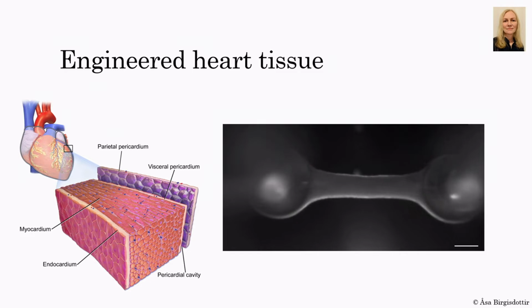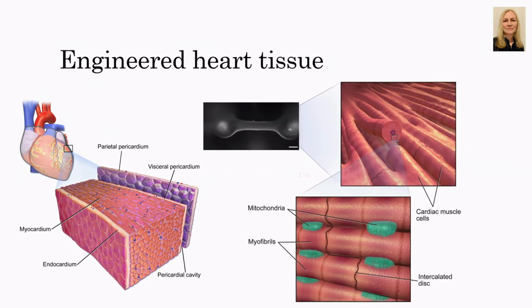And unfortunately, she is also very interested in mitochondria, which are on a completely different scale. So imaging these is a challenge. And I'm in optics, so we work together and try to find a solution for that, getting some 3D fast imaging of mitochondria in really hard-to-image tissues that are not cleared.